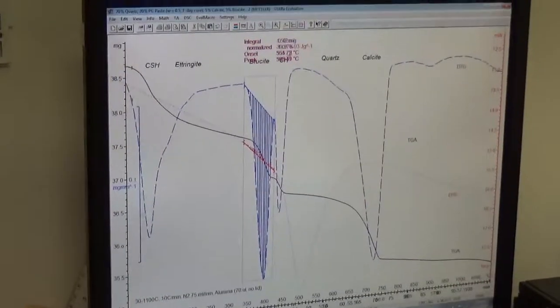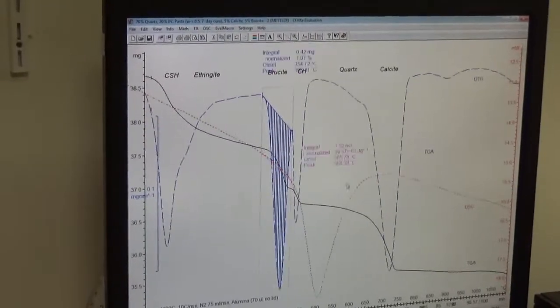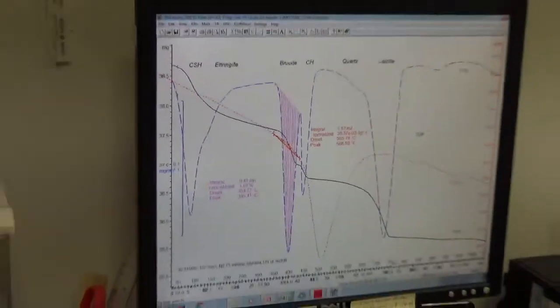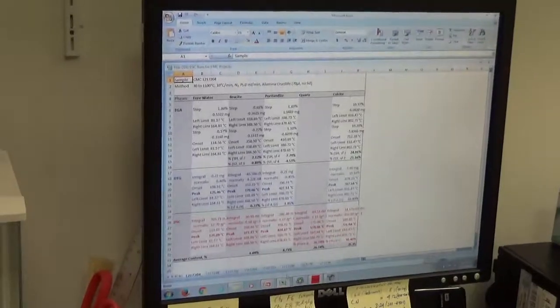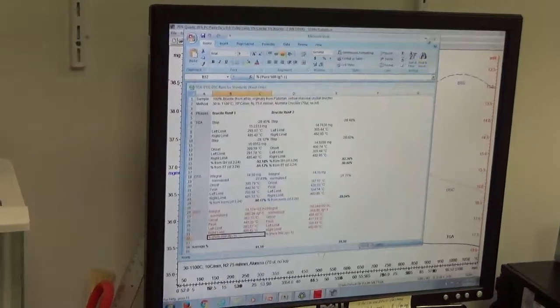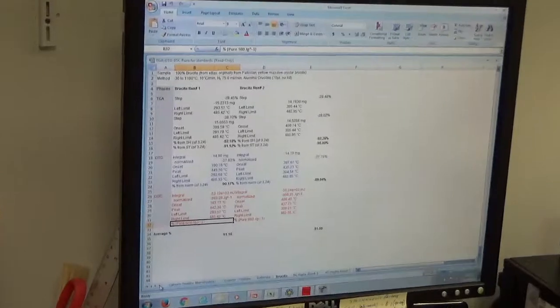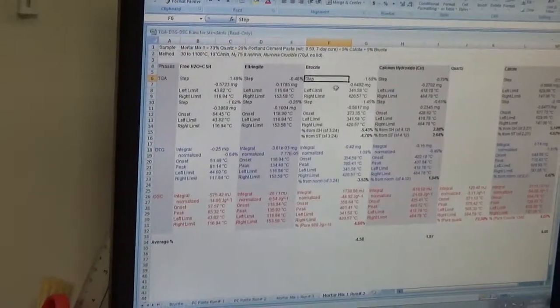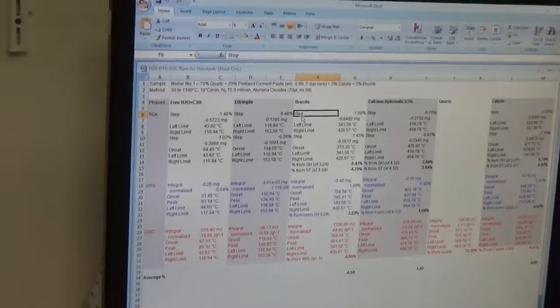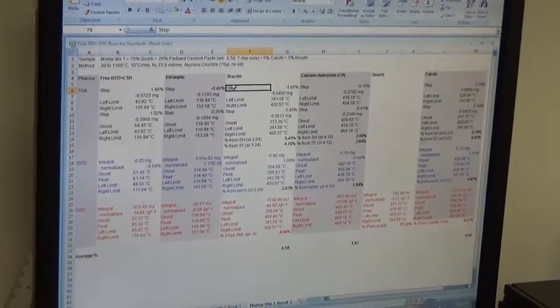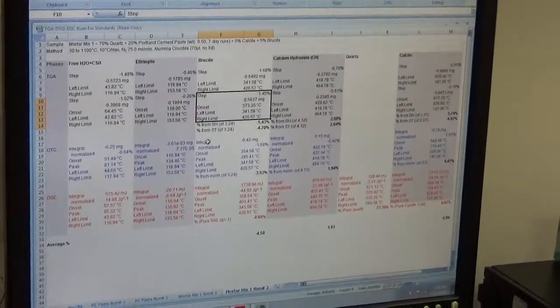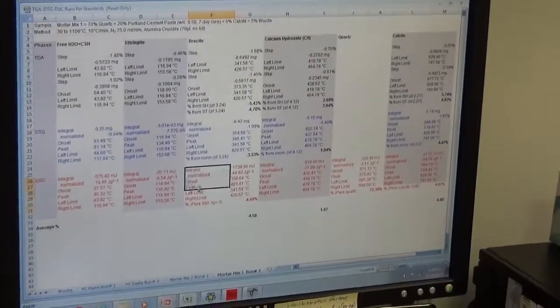We can also choose the DSC curve and Ctrl+F6 gives the integration of the DSC curve. We get the DSC integration, DTG integration, and then copy using Ctrl+C and paste into Excel using Ctrl+V. That's how the step horizontal TGA data, step tangential TGA data, DTG data, and DSC data come. They're all color-coded.